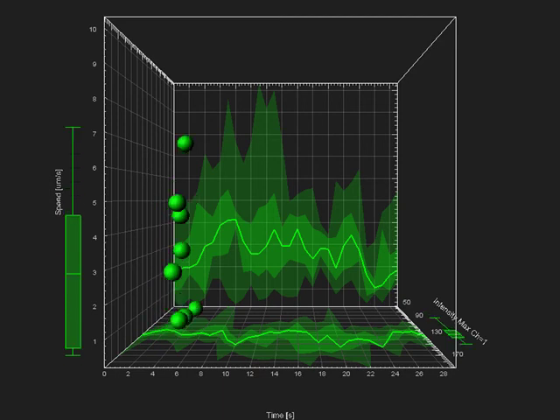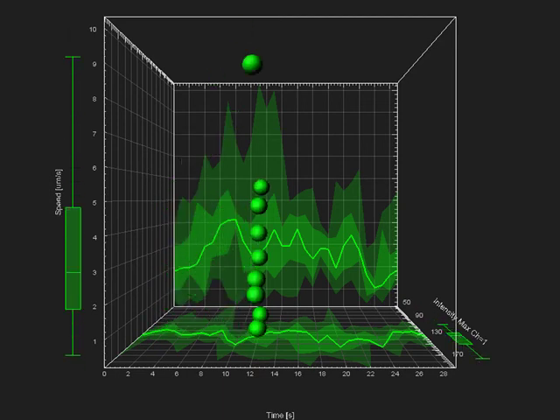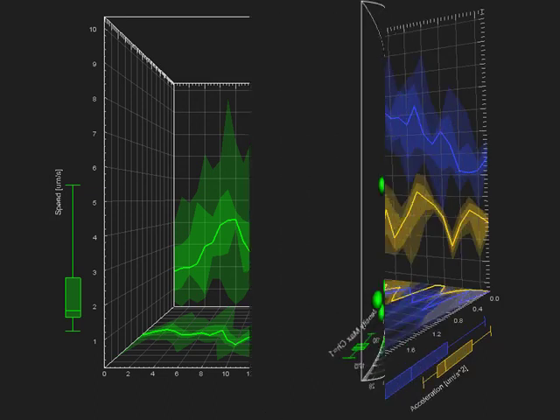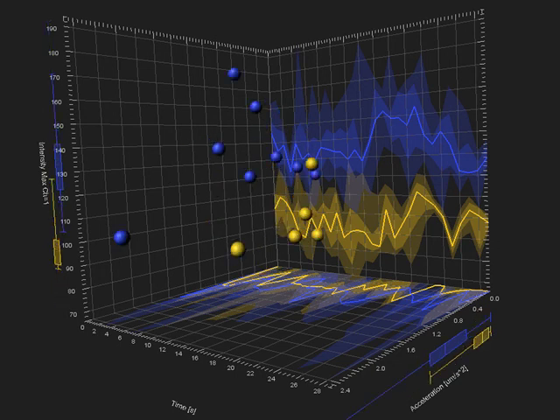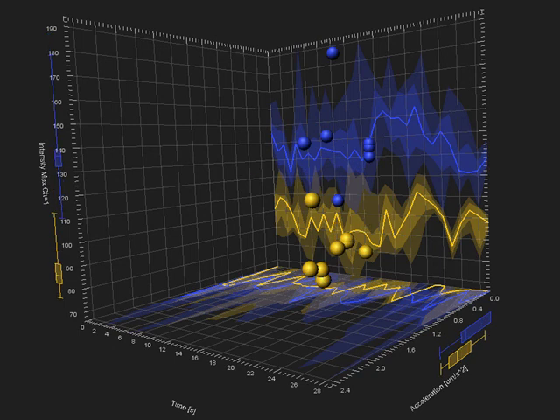On these projection plots, a thick line indicates where the median value lies. The range between the Q1 and Q3 values is shown shaded, while the minimum and maximum range is lighter shaded. You can easily compare how 2 or more variables change across time based on the line position and size of the shaded regions.